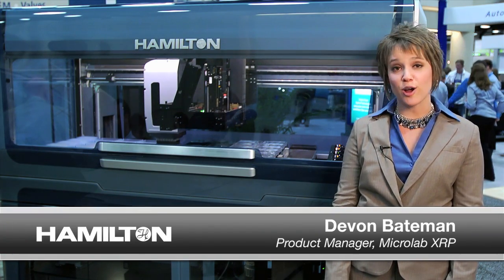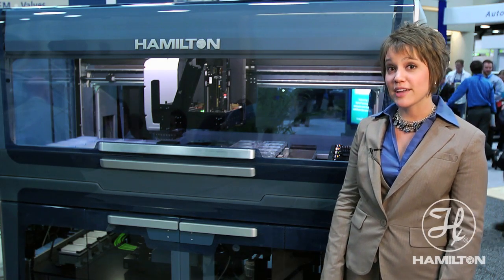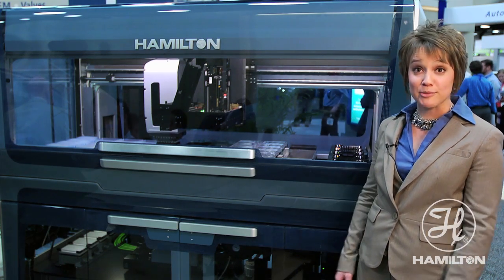Hi, my name is Devon Bateman and I work for Hamilton Company as the XRP product manager. This year we're introducing Microlab XRP, and this is the instrument.